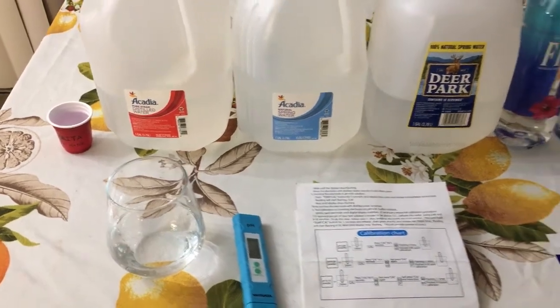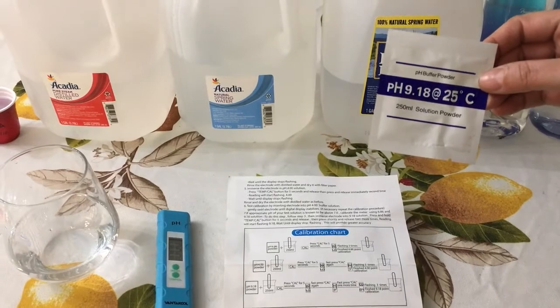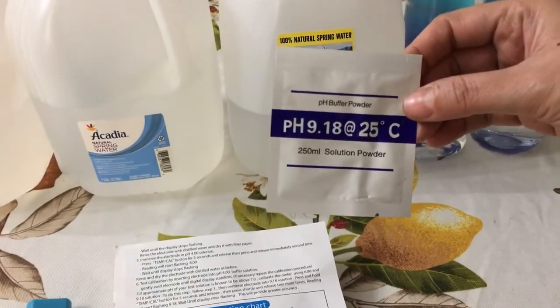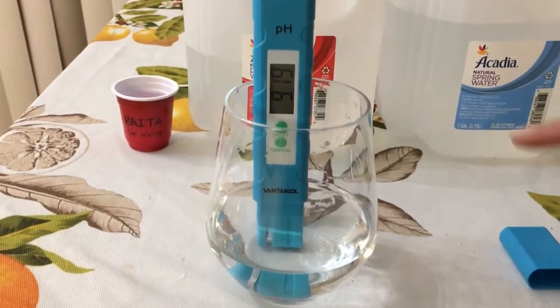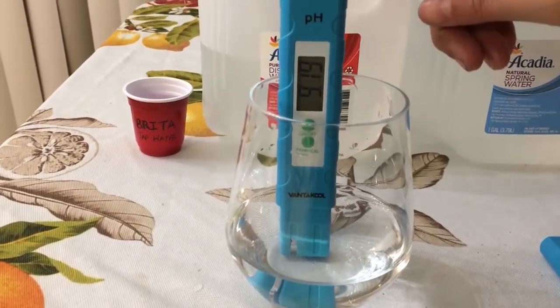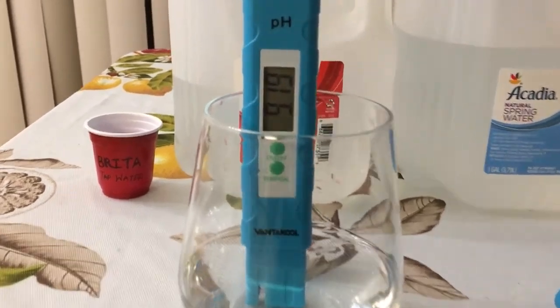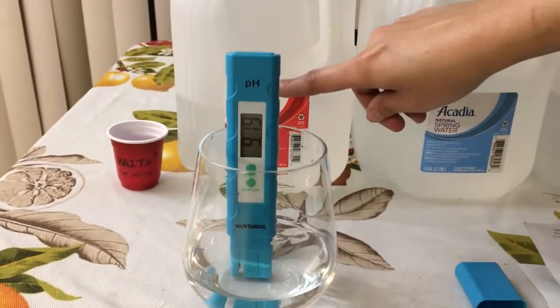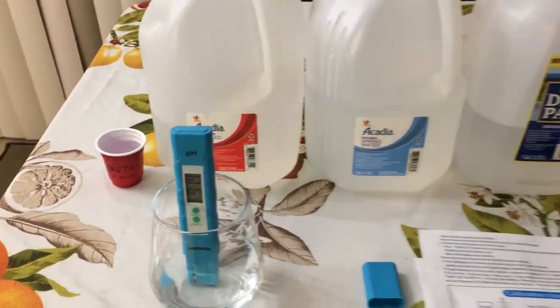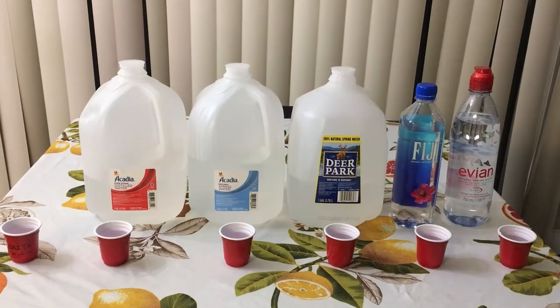Now we are going to calibrate our device for the solution 9.18. I have used the solution of 9.18 and as you can see the device is showing approximately 9.18. Now I'm going to perform a test on these different types of water.